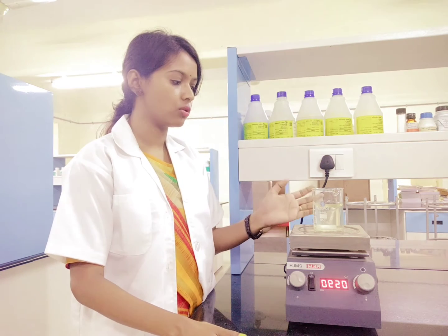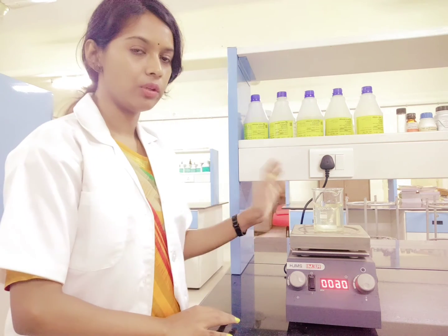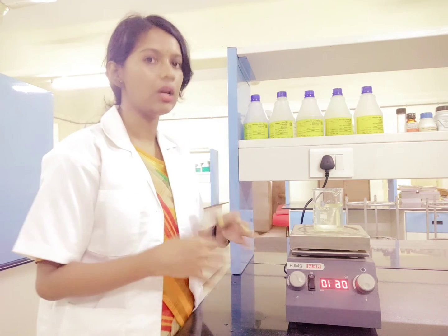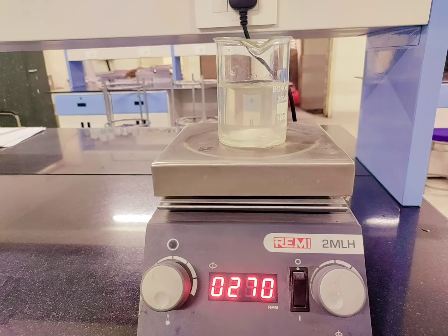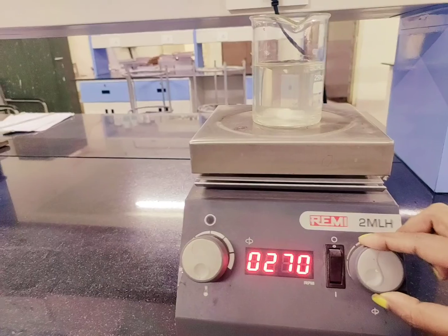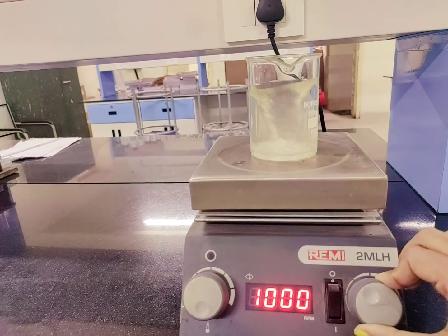Now I will give you a close look so you understand the stirring effect it is giving in the sample. When you take the sample and solvent and keep it overnight, because of this stirring effect, whatever components are present in the food will get extracted into the solvent. You can see the bead in the glass beaker is moving because of the RPM you have set. If you increase the RPM, the stirring effect will also increase — more RPM means it will rotate at more speed.